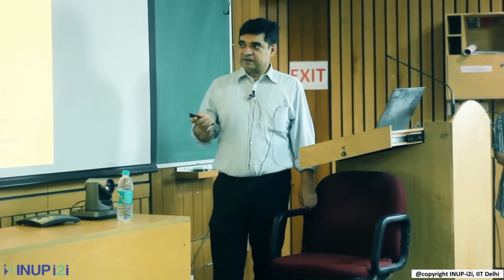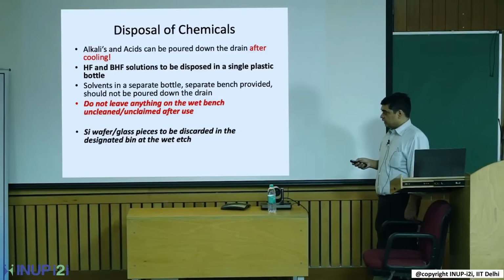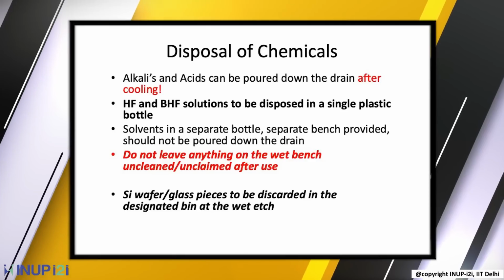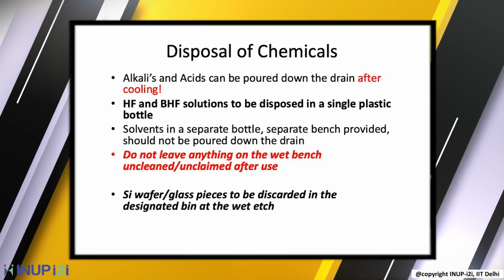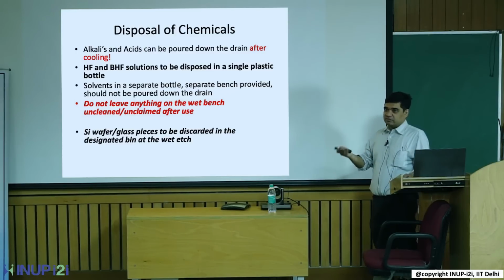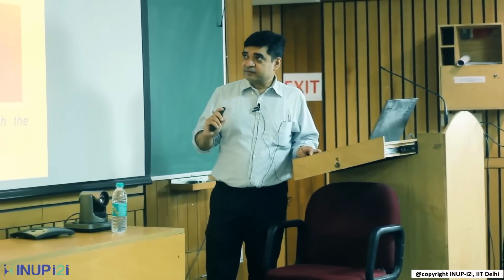Toxic chemicals, you have to be very careful how you dispose of them, right? Also, with the MSDS, be aware of what the chronic exposure effects are. One is acute exposure, the other is chronic exposure. You want to be very careful that chronic exposure is also minimized, right? I think this is done. This is the last part.